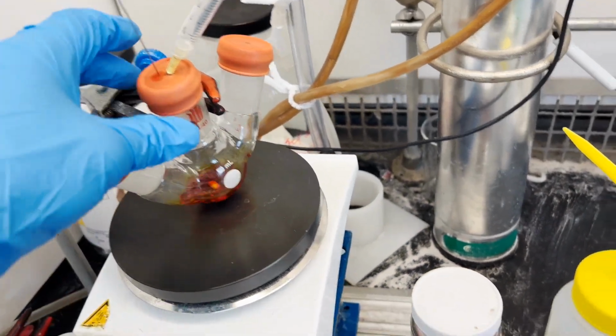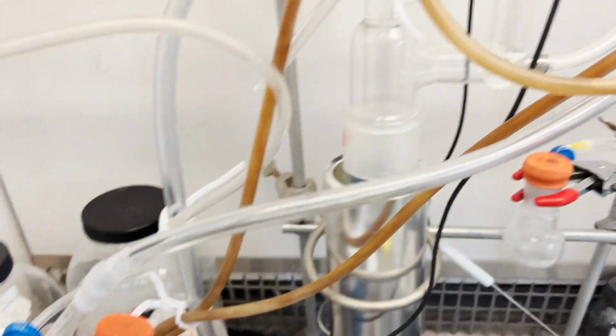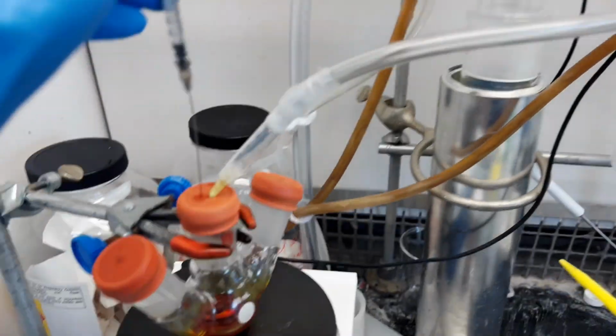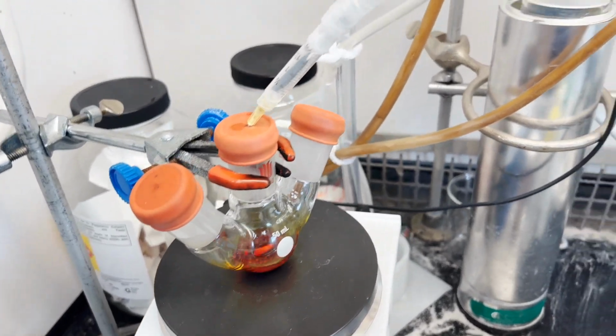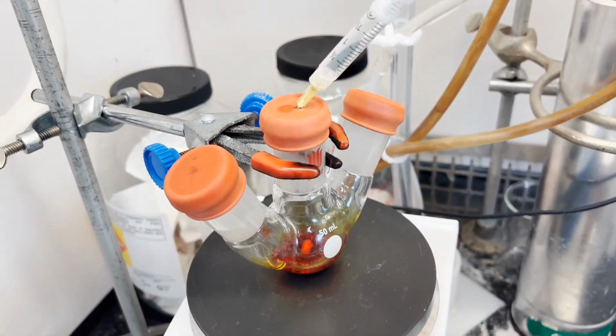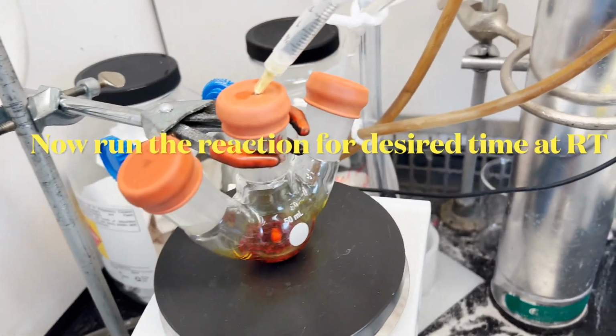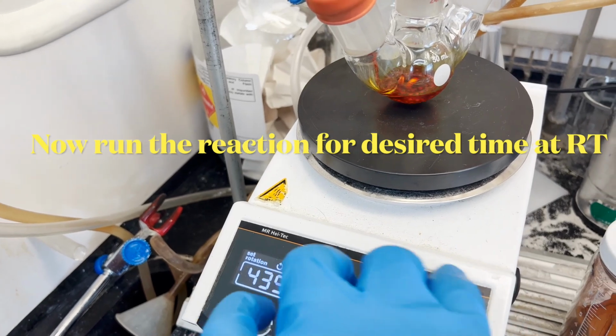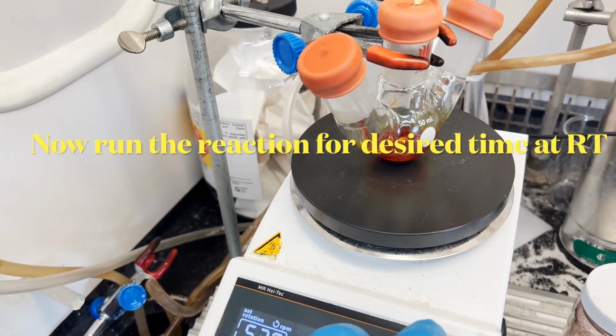So based on different reactions, you might have different reaction times. For me it is 24 hours, so I'll start this reaction for 24 hours at room temperature. If you search the literature, you might see some reactions may also require heating. I'm not sure yet, but this reaction is normally done at room temperature.